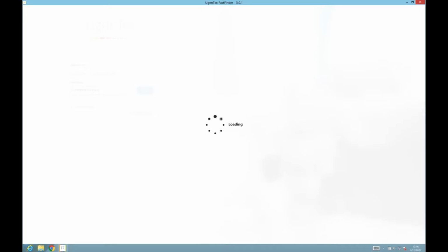So I'm going to simply log into the software. And on that note, really, everything I'm doing after I log in is audit trailed with my name, when it happened, so the user and the timestamp. And this also means that you don't have to do constant typing in of signatures, for instance.